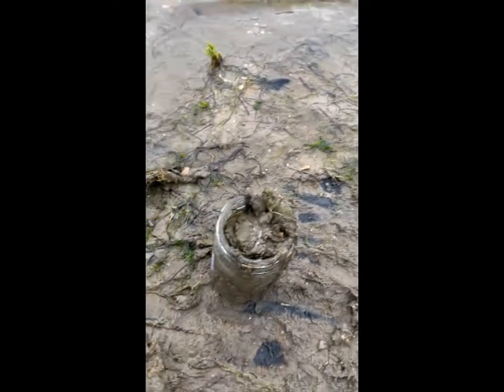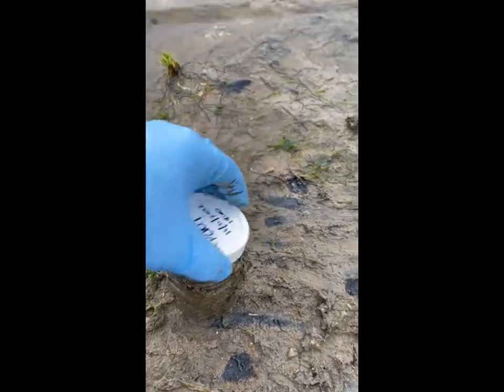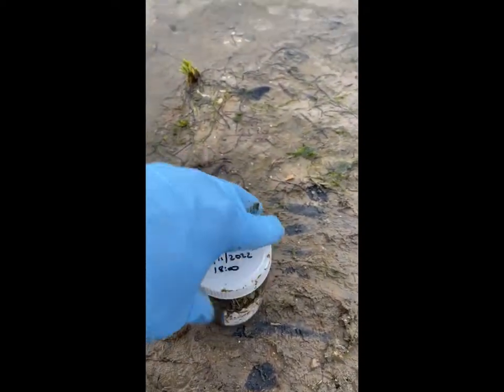Then continue sampling using the second jar. Once the second jar is full, replace the lid and wipe the outside of the jar.